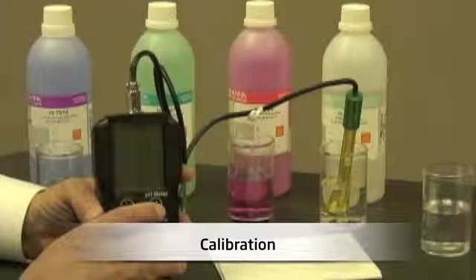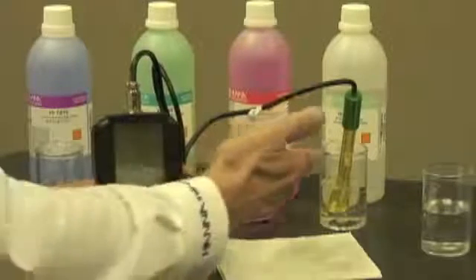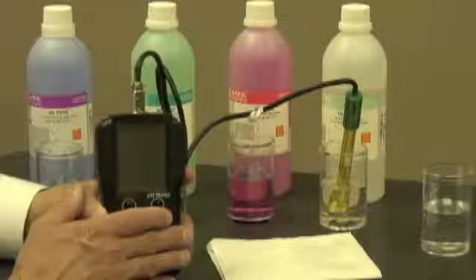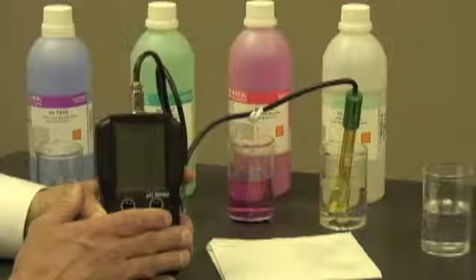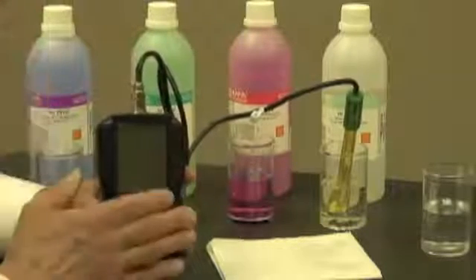Before using a new probe for the first time, it's very important to condition it first. As you can see here, I've taken the liberty of putting the probe into a storage solution. In this case, it's HI70300. If you don't have a storage solution, that's okay — you can put it in a buffer as well.